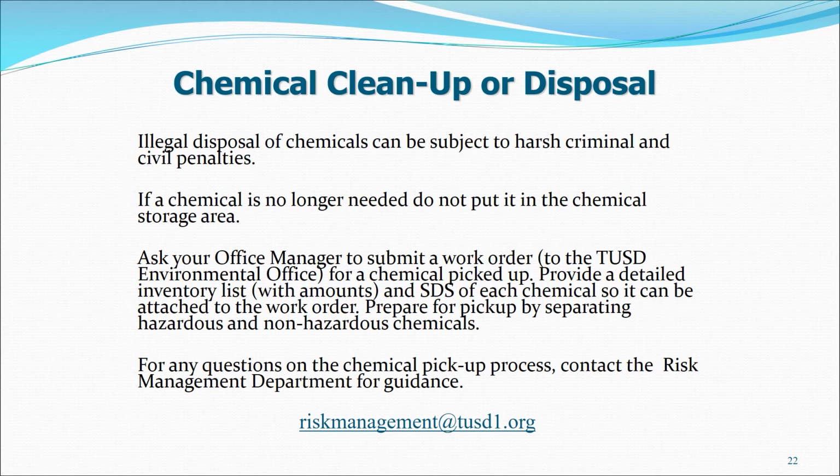Getting rid of waste chemicals should be part of your laboratory process. Remember, illegal disposal of chemicals can cause serious problems if dumped down the drain or trash and could subject your school to harsh criminal and civil penalties. If a chemical is no longer needed, do not put it in the chemical storage area. It will become a hazard.